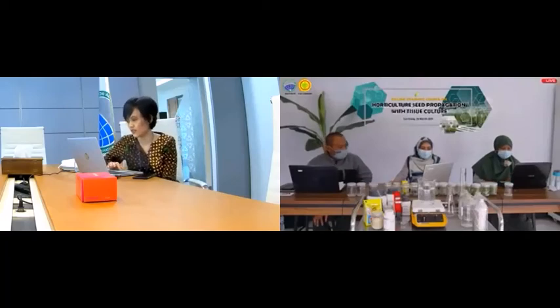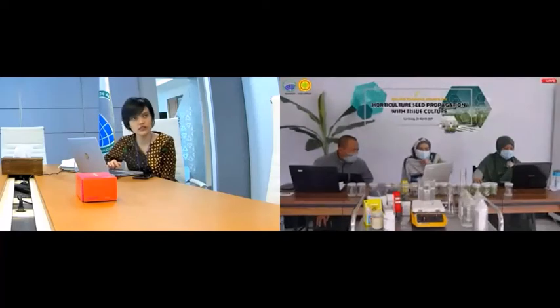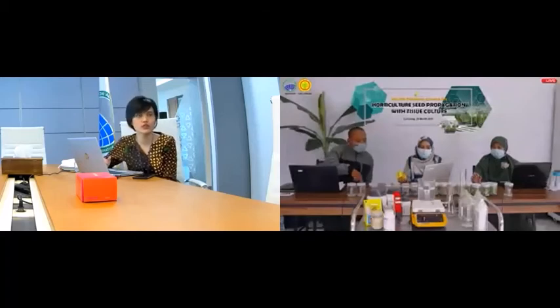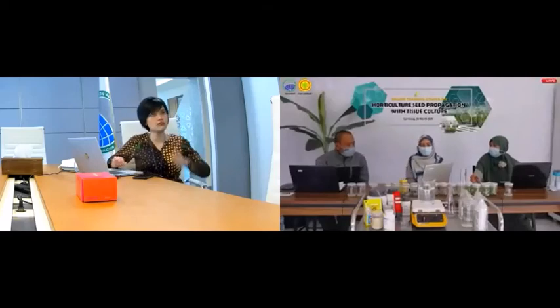There is another question. This question came from Vietnam and Solomon Island. The same question: what is the use of alcohol during this experiment? Which purpose, and is there any intention to use alcohol in sterilization of the explant? I think you have answered about this earlier, but maybe you could provide further details, especially since you mentioned povidone iodine earlier: when should we use povidone iodine, and when should we use alcohol or other ingredients for sterilization? Mr. Abdul Rohim, please, the floor is yours.